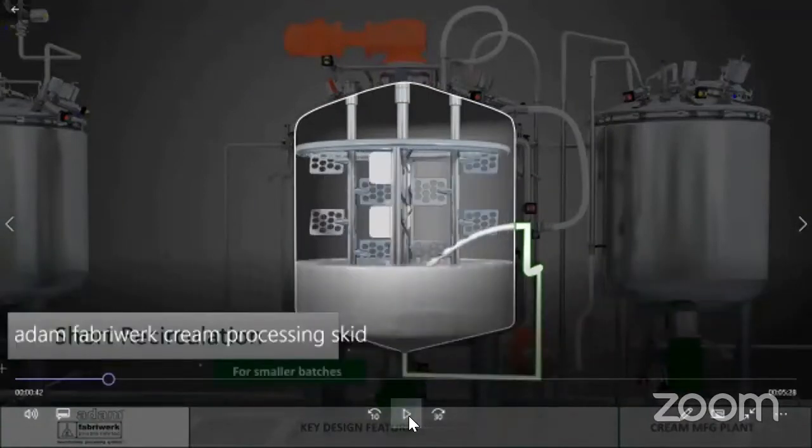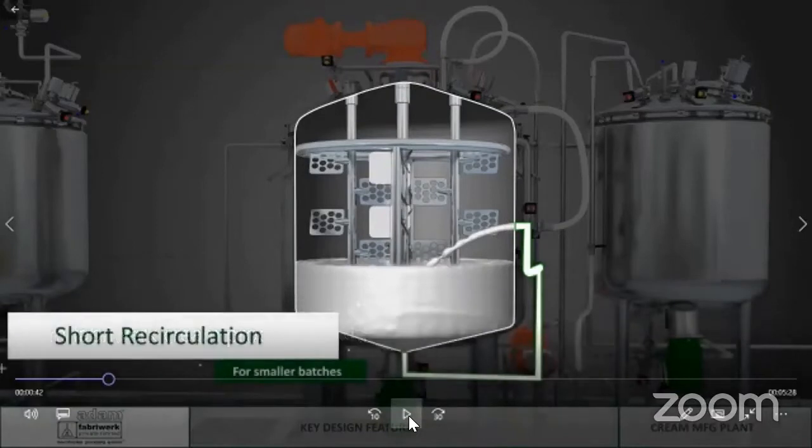The special feature that you see here is a short recirculation path for smaller batches. This is very important for processing smaller than half the volume of the batch size of the vessel. If the vessel capacity is 1000 kilos and you have to process 400 kilos, then this short recirculation loop takes care of the shorter recirculation. This ensures that the product comes through the path directly into the vessel without shearing or damage.